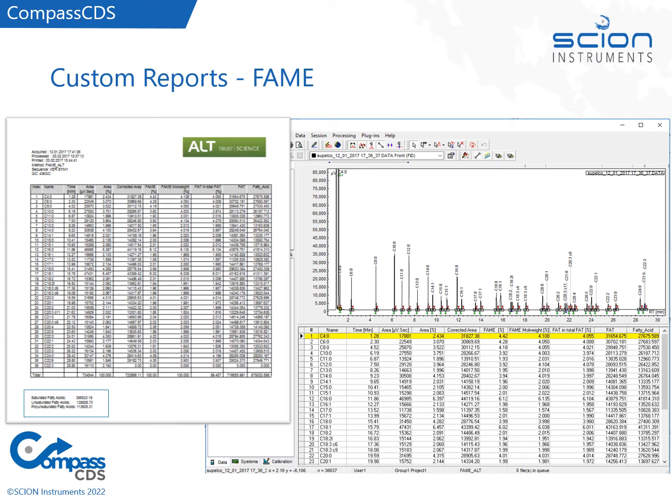However, every customer requires different types of information on their report. And on these reports, you can have information such as the date that the data was acquired, the date it was processed, when it was printed, who it was printed by, who it was processed by, and the batch names for the analysis. Any piece of information that is specific to that injection can be included on a report.